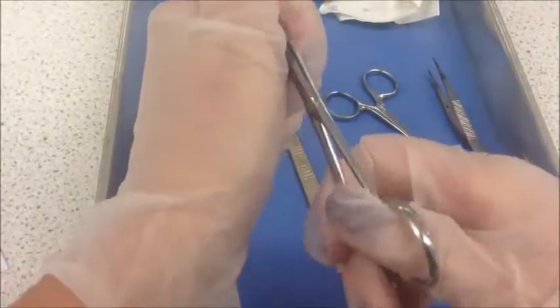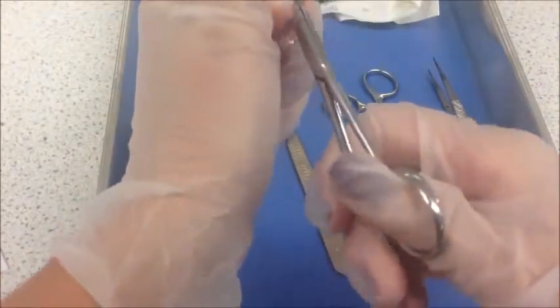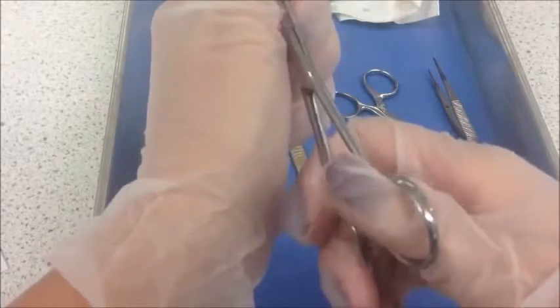The clear jelly that is oozing out there is called the vitreous humour and is made up of protein and water. This liquid helps keep the shape of the eye and is clear to let the light through it.